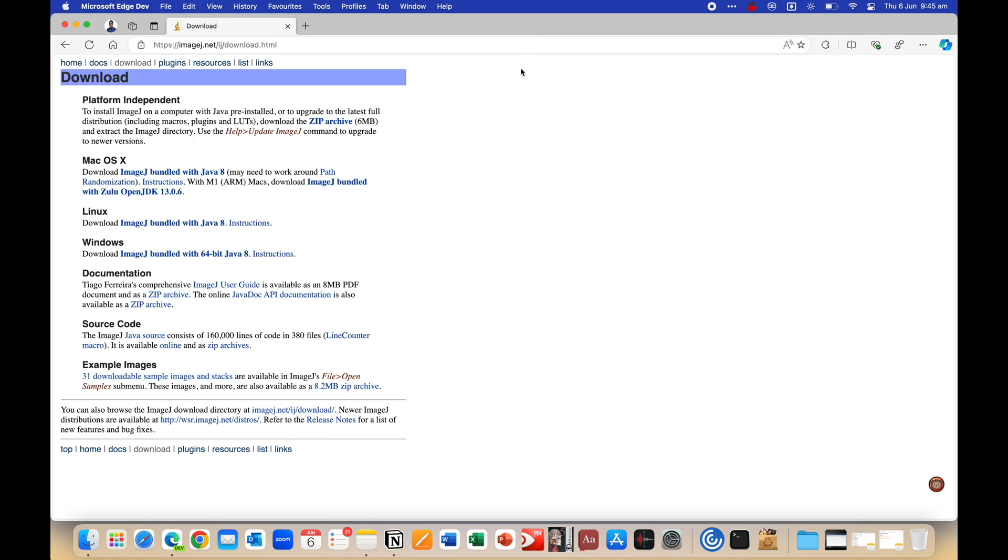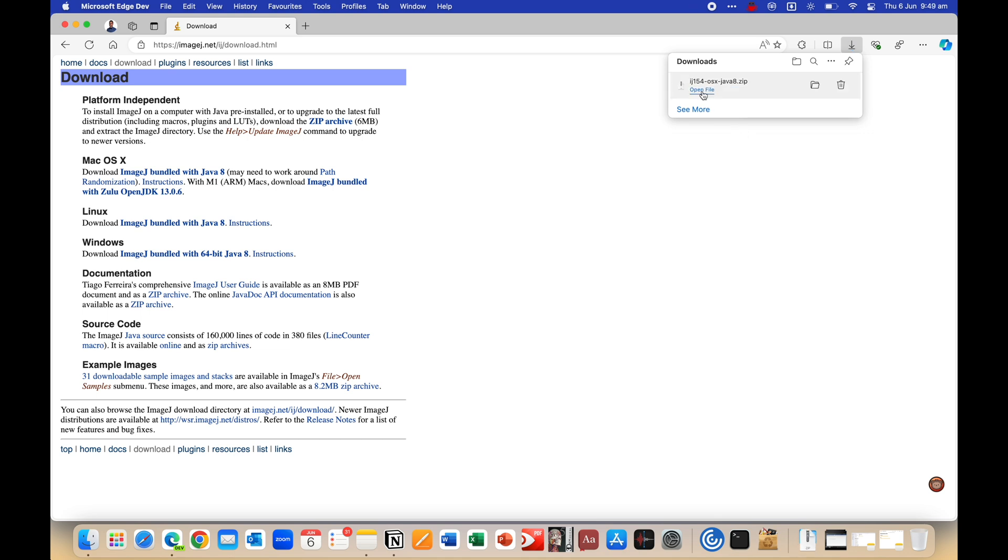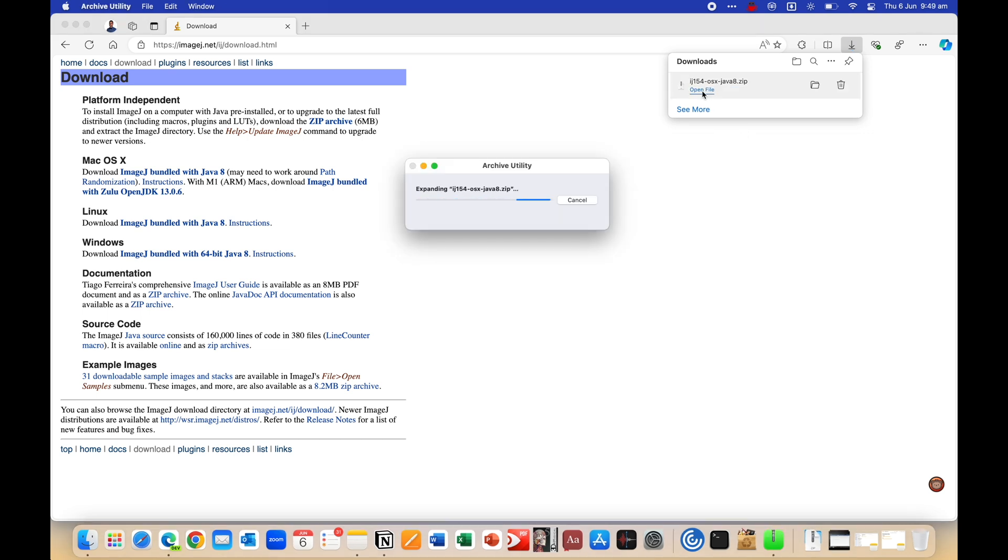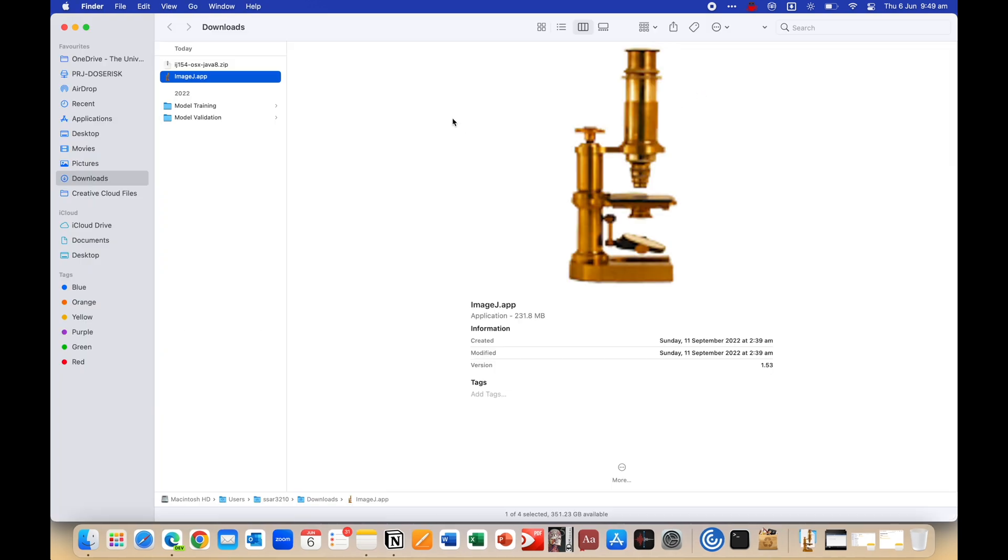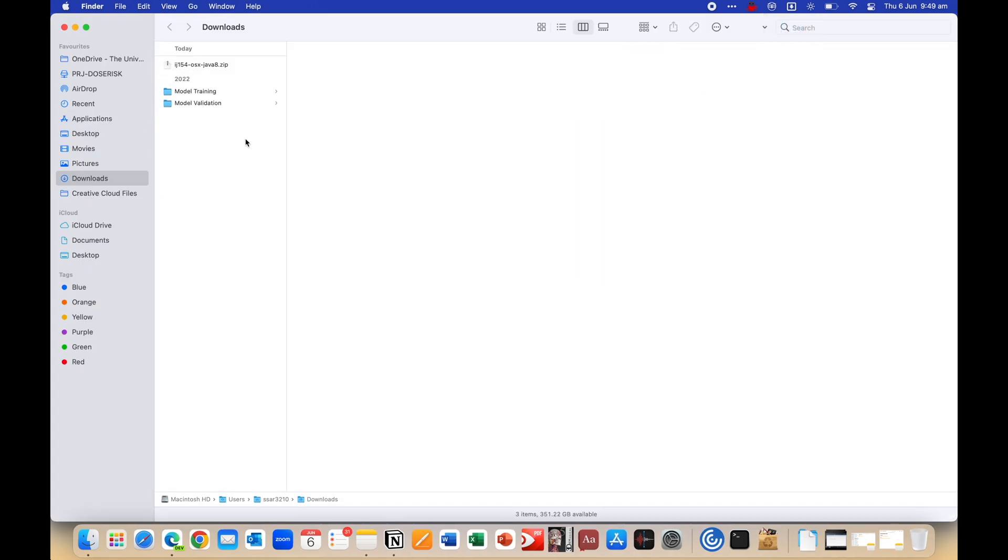Once you do, you'll end up on a site like this and you can just click on one of these here. Now this other link also works in my experience, so if the first one's giving you some trouble, just download the other one. Once you've downloaded the zip file, open it up and that's basically the app. Now you can either download it right here in the downloads folder, but I like to drag it into the applications folder so you can access it from the launchpad.